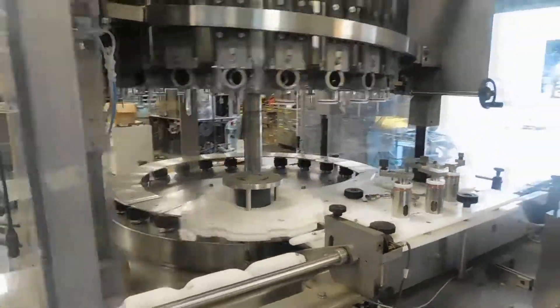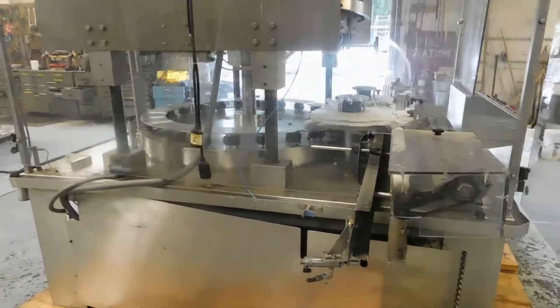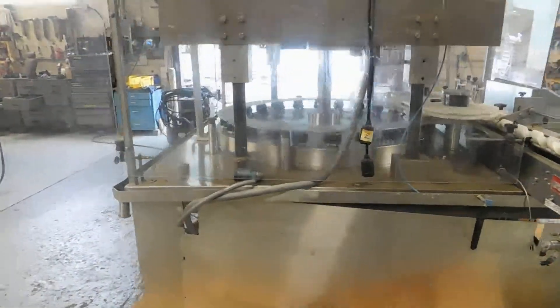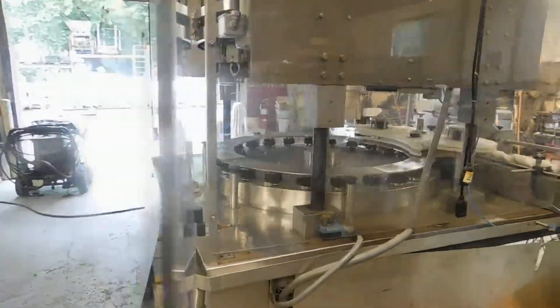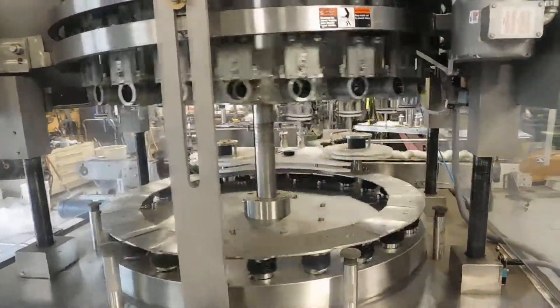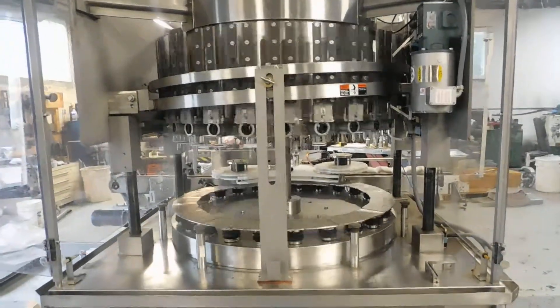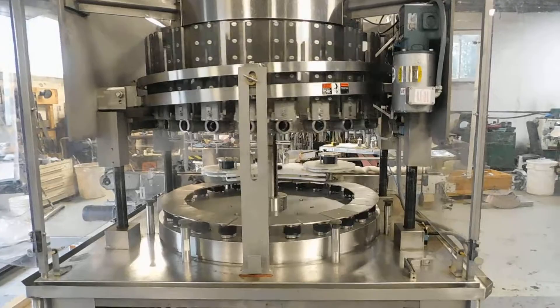The machine, as you can see, is all stainless steel. Designed for pharmaceutical service. It's a timely screw-in feed to, of course, the star wheels. It has a mechanically adjustable cam, driven by the motor you see up there on the right, so you can adjust the amount of weight putting in each piston.